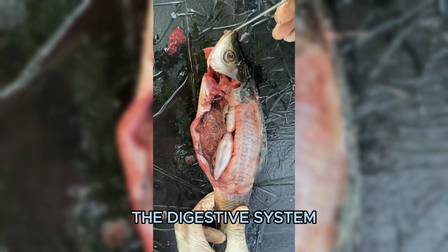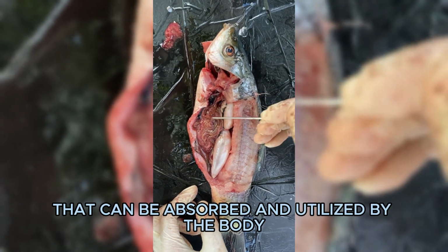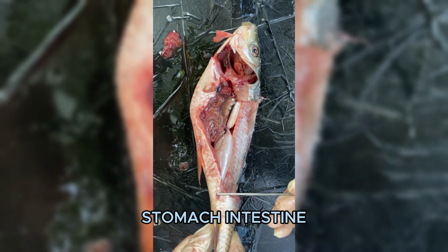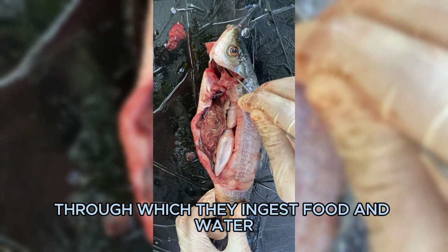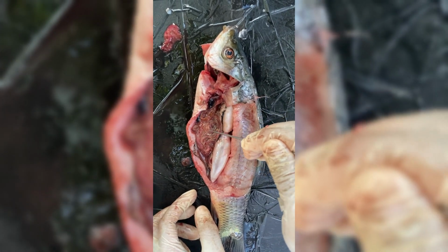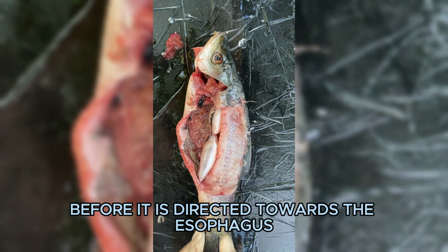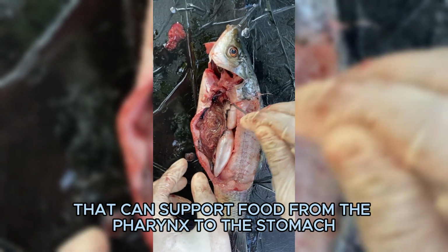The digestive system in fish is responsible for breaking down food into nutrients that can be absorbed and utilized by the body. It typically consists of the mouth, pharynx, esophagus, stomach, intestine, liver, and pancreas. The mouth is the opening through which they ingest food and water, and it is located at the front of the head. For the pharynx and esophagus, the pharynx serves to initially process food before it is directed towards the esophagus, while the esophagus is a muscular tube that transports food from the pharynx to the stomach.